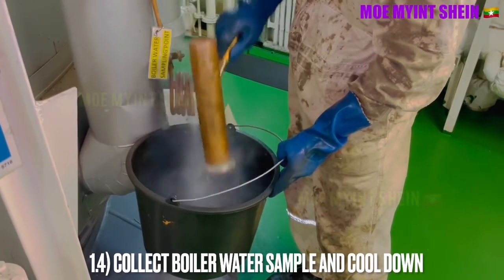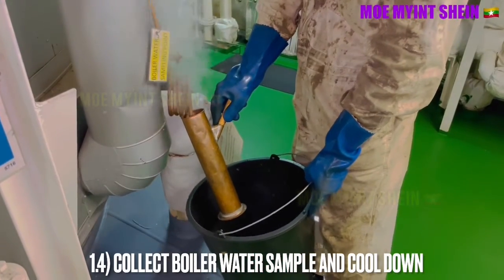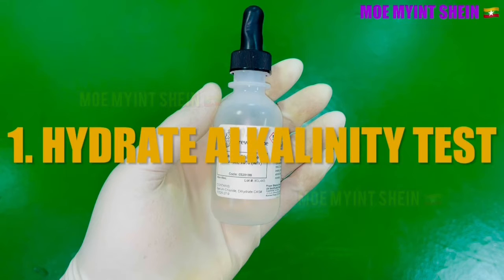The hot boiler water sample needs to cool down before analysis. As the first test, we will carry out the hydrate alkalinity test.